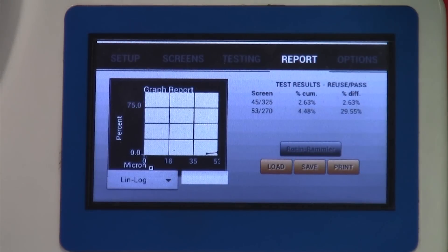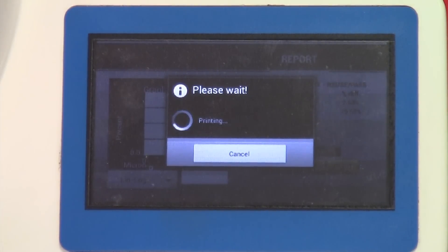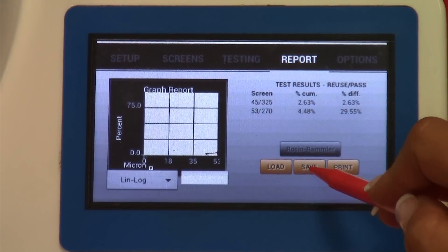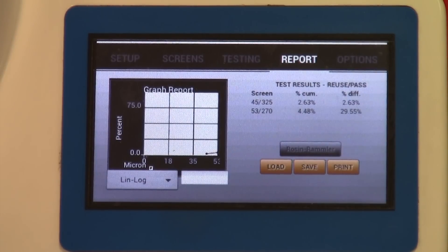On the report page, you'll see the graph report, which will also appear on a larger scale when printed. It shows the sieve screens listed from finest to coarsest along with the test results. To print the results, select Print and it will send the data to the printer. You can also save the results — when you press Save, results are saved under the company name, operator, sample, and lot number from the setup page. To load a previously saved test, press Load to retrieve and review old results.